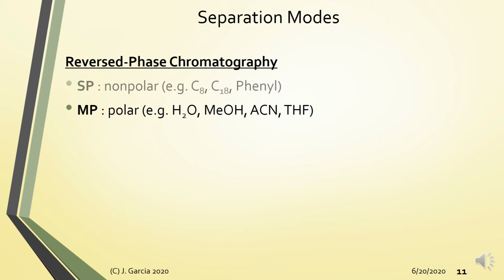And even ion pairing agents can be added into your mobile phase. Reversed phase chromatography can be used for a wide range of compounds, from organic molecules to ionizable organic molecules to even biomolecules. Actually, around 70 to 80% of published literature on chromatography is based on reverse phase chromatography. That's how robust and dynamic this separation mode is.